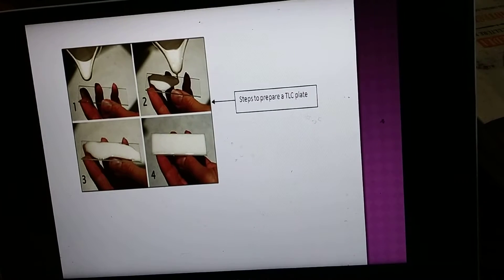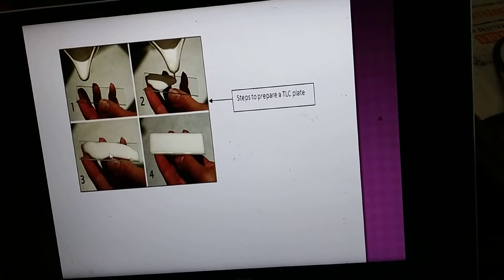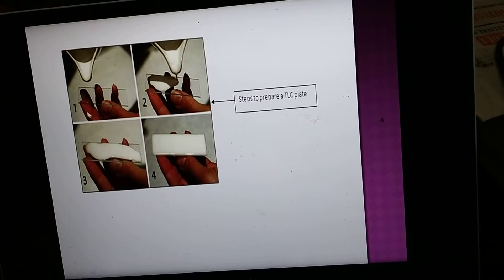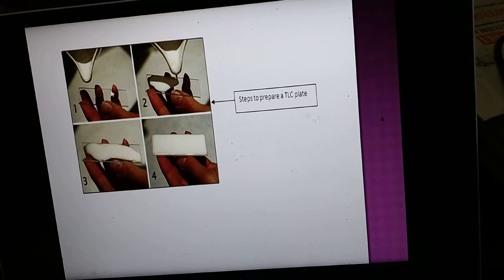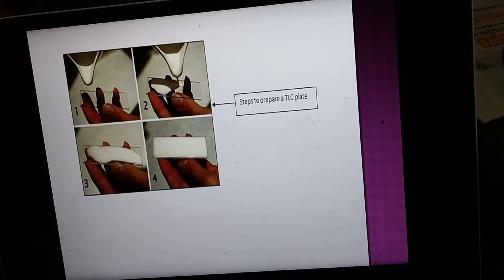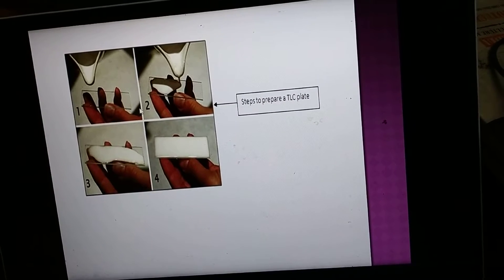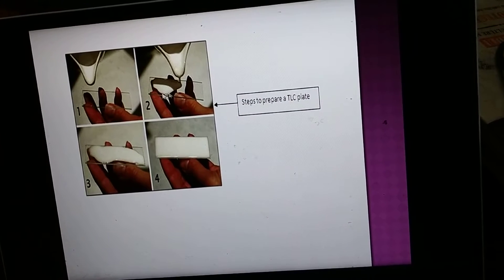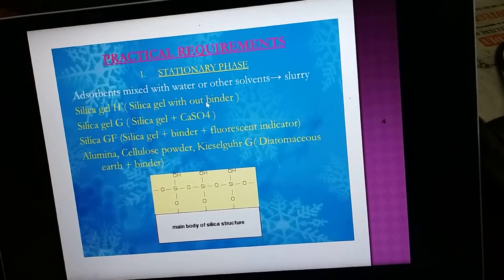This is the slurry, containing silica powder plus water. The TLC plate is uniformly prepared for the experiment. First, preparation of the slurry takes place, and after this you dry it in an oven or other heating instrument. After 10 to 15 minutes it will dry and you can use it for the next experiment.